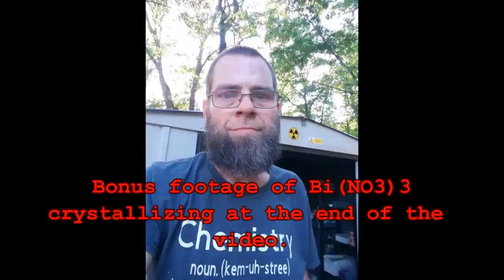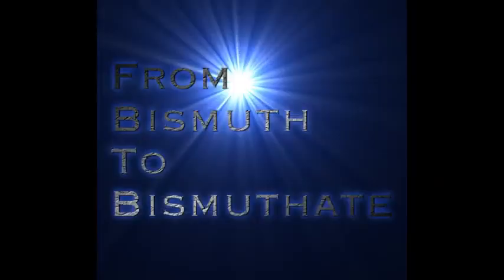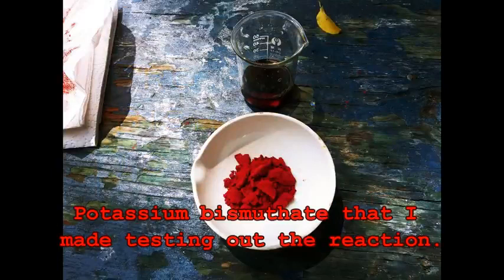I am your host, the Poor Man himself, and in this video I will be demonstrating the synthesis of bismuth trioxide from bismuth metal. This will be the first in a series of videos called From Bismuth to Bismuthate, which details the synthesis of sodium or potassium bismuthate starting with bismuth metal.